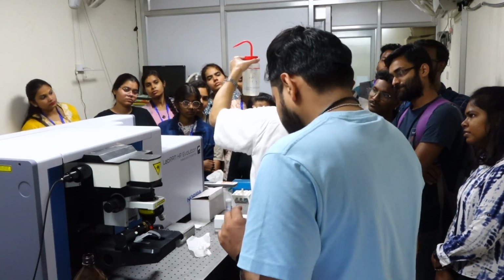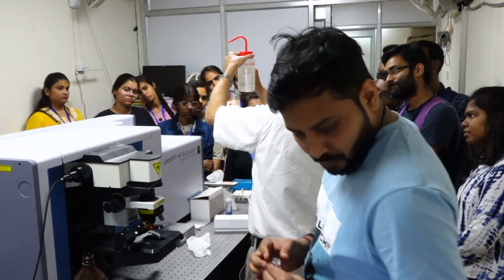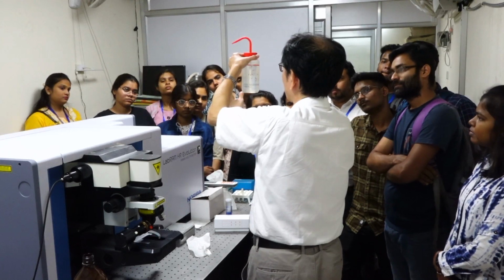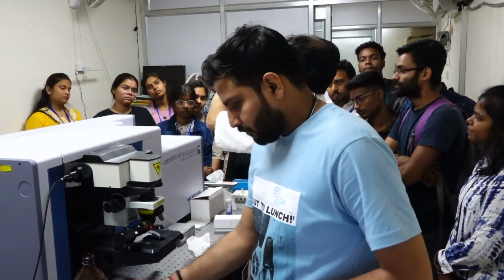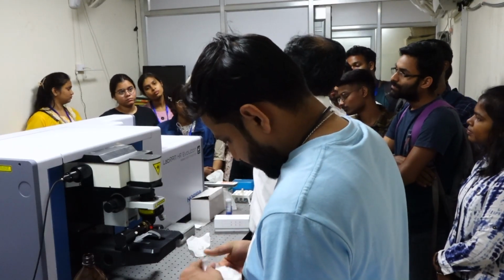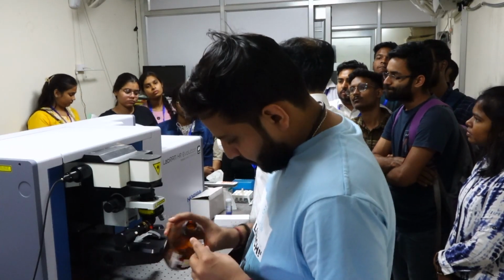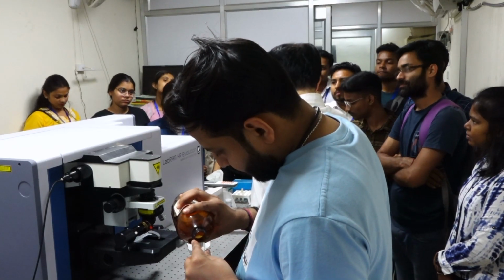If we put the lens at 90 degree, laser goes straight and Raman scattering goes everywhere. So the collected Raman signal increases. It's advantageous. Still, there is Rayleigh scattering, so the wavelength of the laser beam still remains, but weaker. So usually we choose 90 degree scattering configuration.